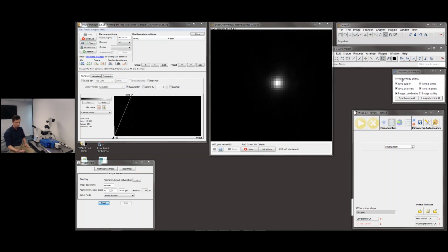So mostly we use 3N. In our software, this is what we use, 3N, and we try to use fluorescent beads because those are non-bleaching samples, non-bleaching specimen, which is easy to work with, and you can also judge the quality of the PSF using a fluorescent bead. So I guess we can turn now to the hands-on part.